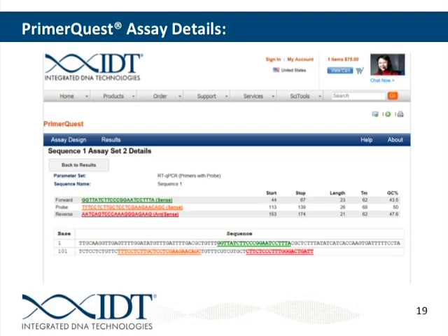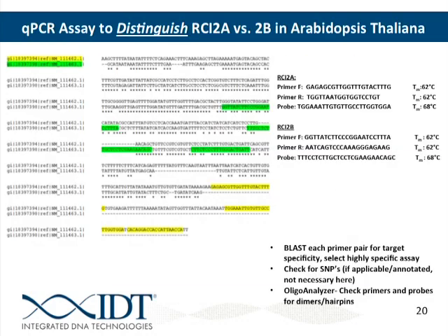And so now we see this, our Arabidopsis 2B. So that's concerning because we're designing specifically to 2A. So why is that there? What's happening? So we go down here to look further at what that might be. And you can actually click right there and it'll pull you down there. And you see, oh, well, this is a user-submitted sequence where they've created a fusion between 2A and 2B. So that's not likely to be a concern for our assay design.